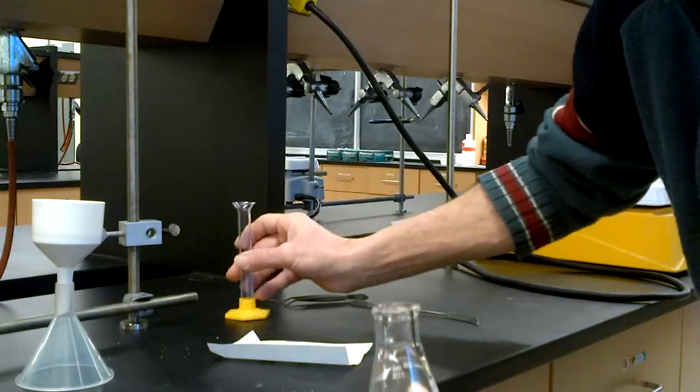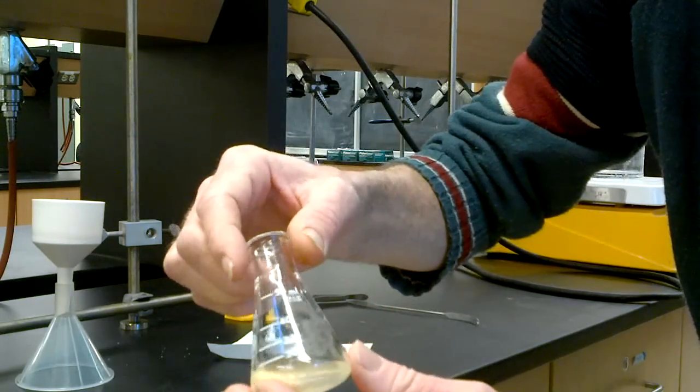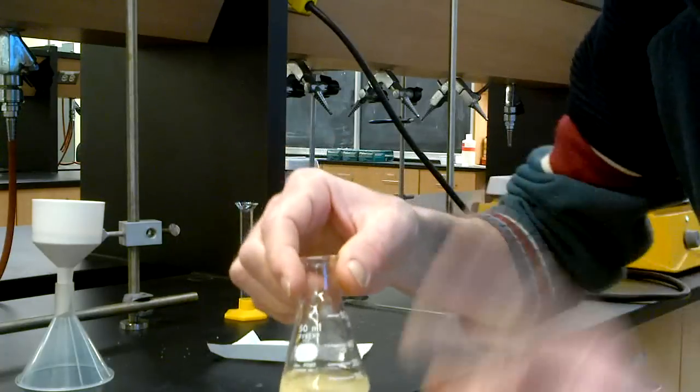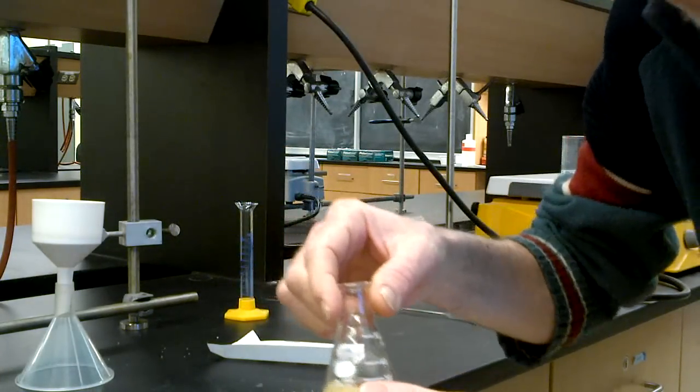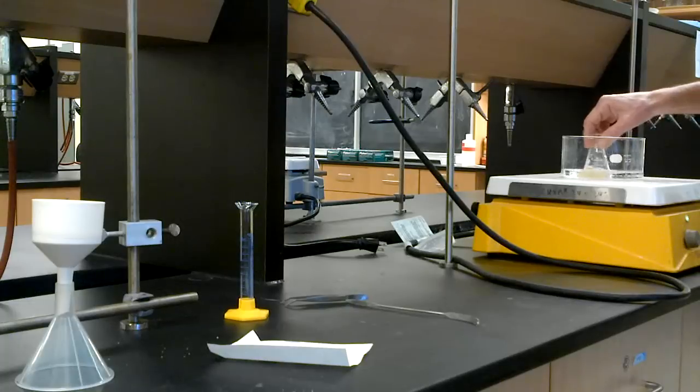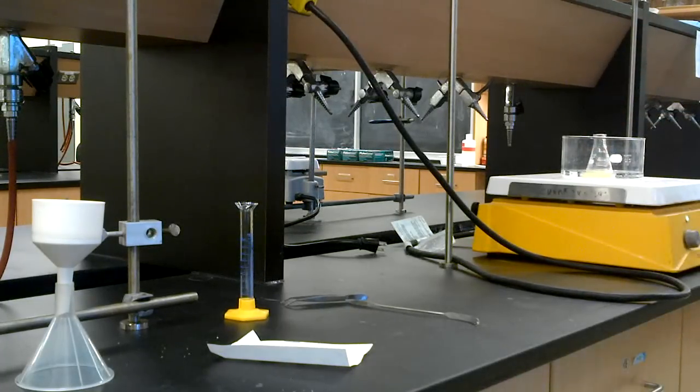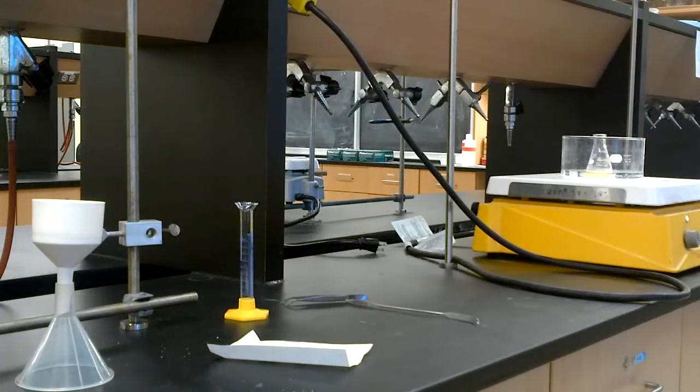Whenever you heat a flammable solvent, particularly when the boiling point is less than the boiling point of water, you use a water bath. That way, you're less likely to have a fire. So here we go, into the hot water bath. That will just take a minute, and hopefully will dissolve. Otherwise, we'll have to add some more solvent.